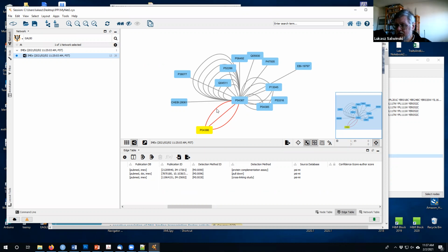So once more, notice that those multiple edges connecting proteins, when the interactions are coming from IMEx, from PSICQUIC, correspond to separate experiments. This is essentially the same interaction, but identified in three different independent ways. What else do we have?